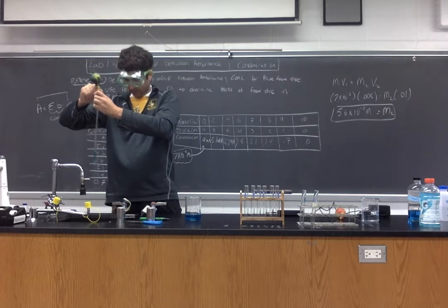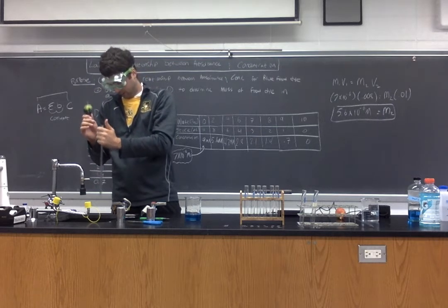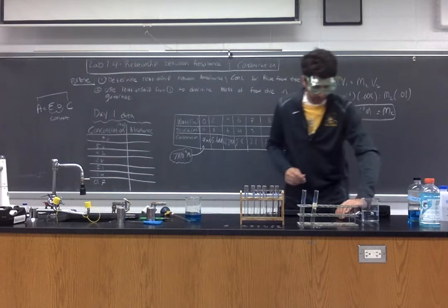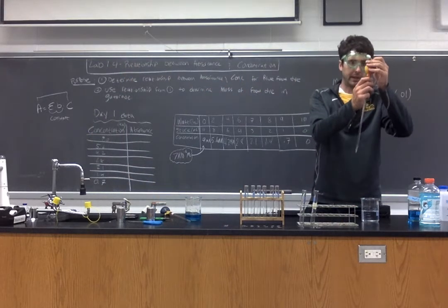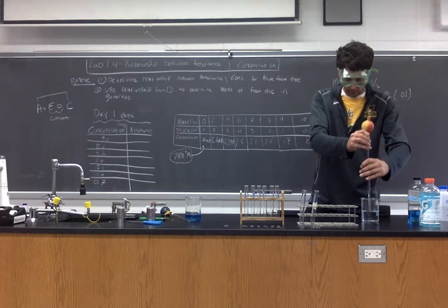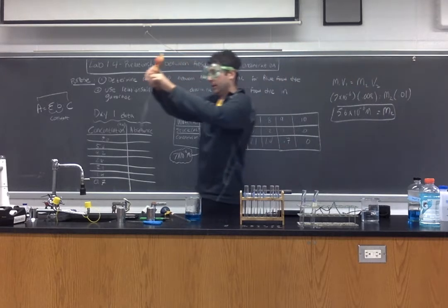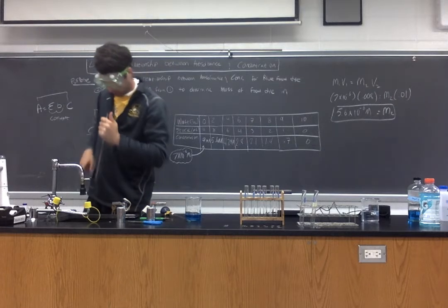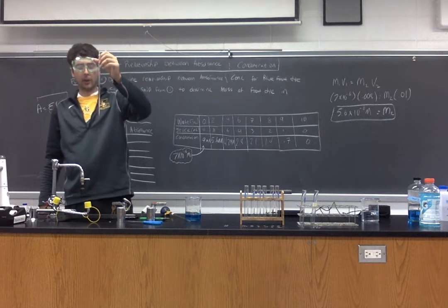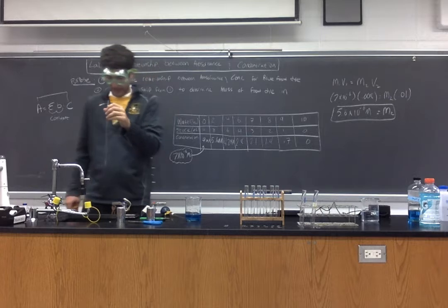Takes a little bit to empty with these things. I'm going to do the same thing with my deionized water. Once again, I want to ensure that I'm rinsing out any contaminants, and the only thing inside of the volumetric pipette is, in fact, the liquid or the solution that we want. This one's a little bit harder to see because it is a clear liquid. What I'm going to do now is let this rinse out to ensure, once again, that all we have inside of our pipettes are either deionized water or stock solution.